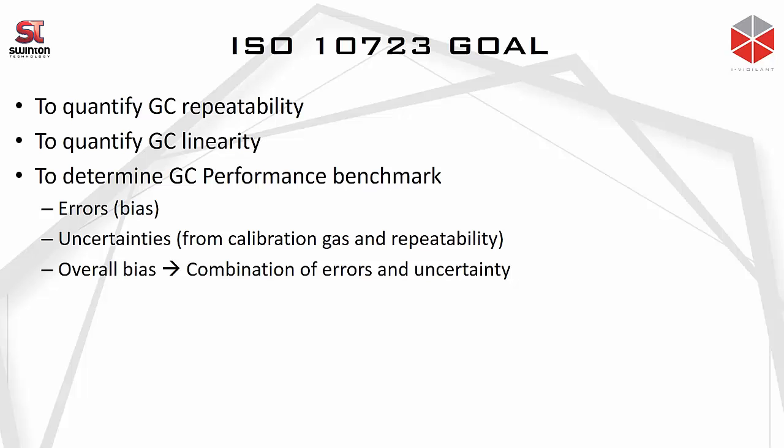I'm not going to discuss the repeatability or uncertainty part too much. The uncertainty calculation is very similar to session 4 that we discussed earlier. The only difference is that it creates a function in the form of a constant, which we call a precision factor, as part of the repeatability.